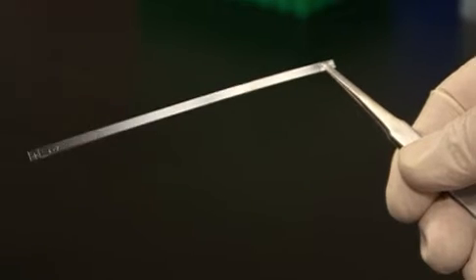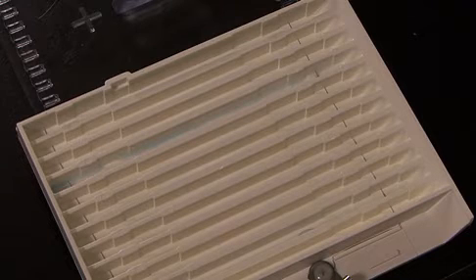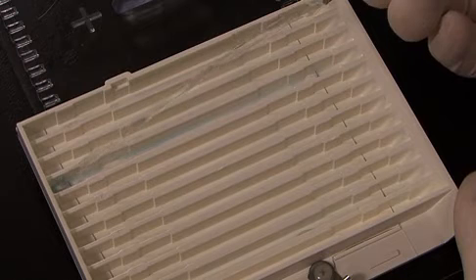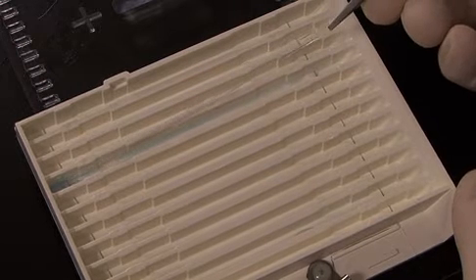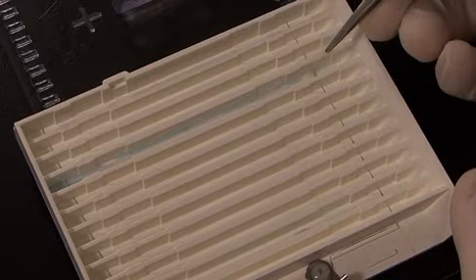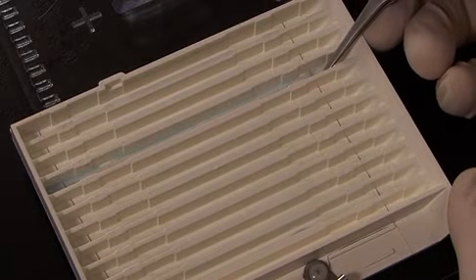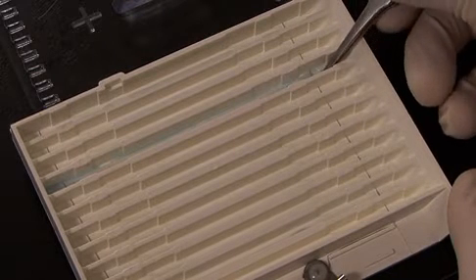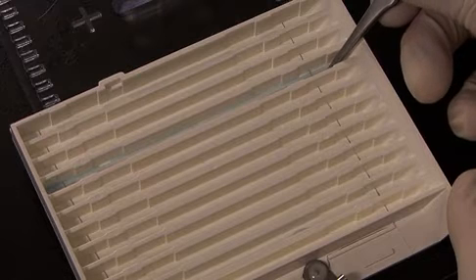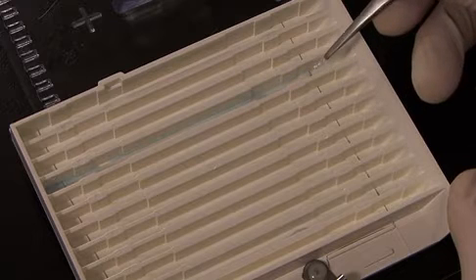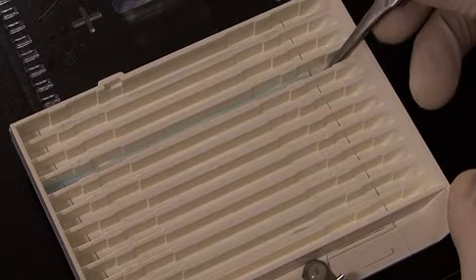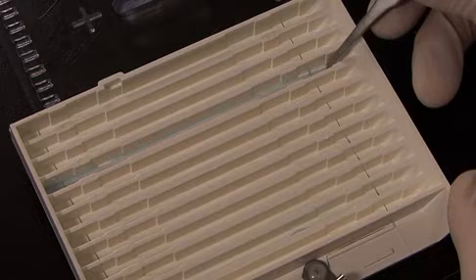To load the IPG strip into the focusing tray, place the positive end of the IPG strip into the positive electrode of the focusing tray and slowly drop your IPG strip into the lane of the focusing tray, being very careful not to trap any air bubbles. If there are any air bubbles trapped, you can pick up the end and gently reposition the IPG strip until the air bubbles are expelled.